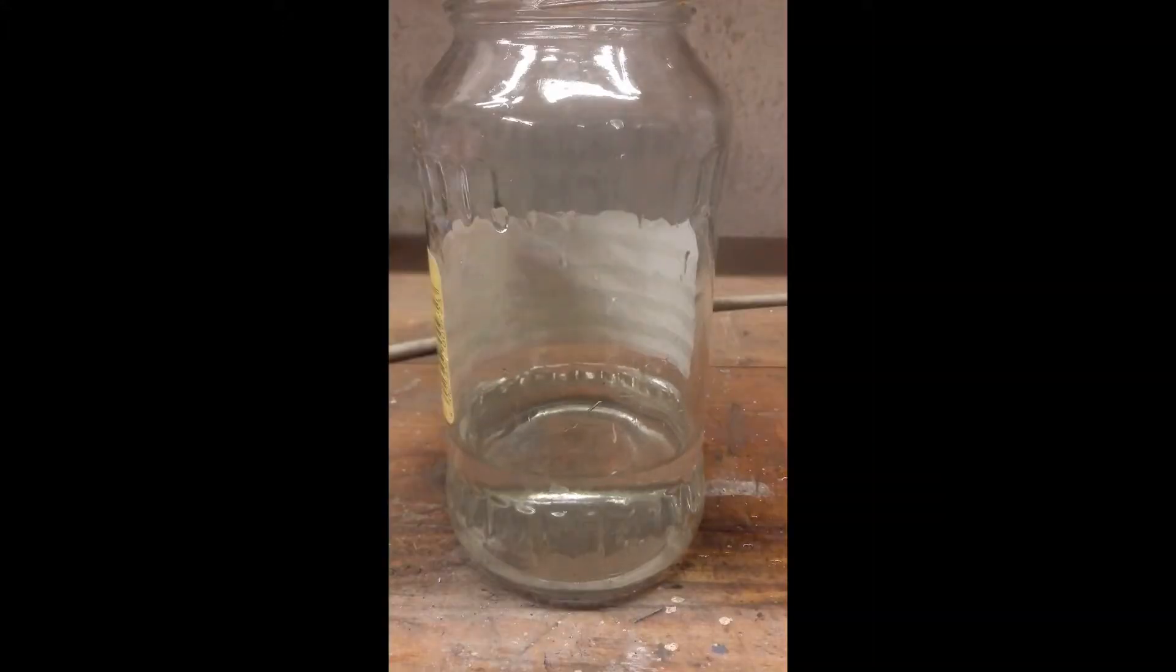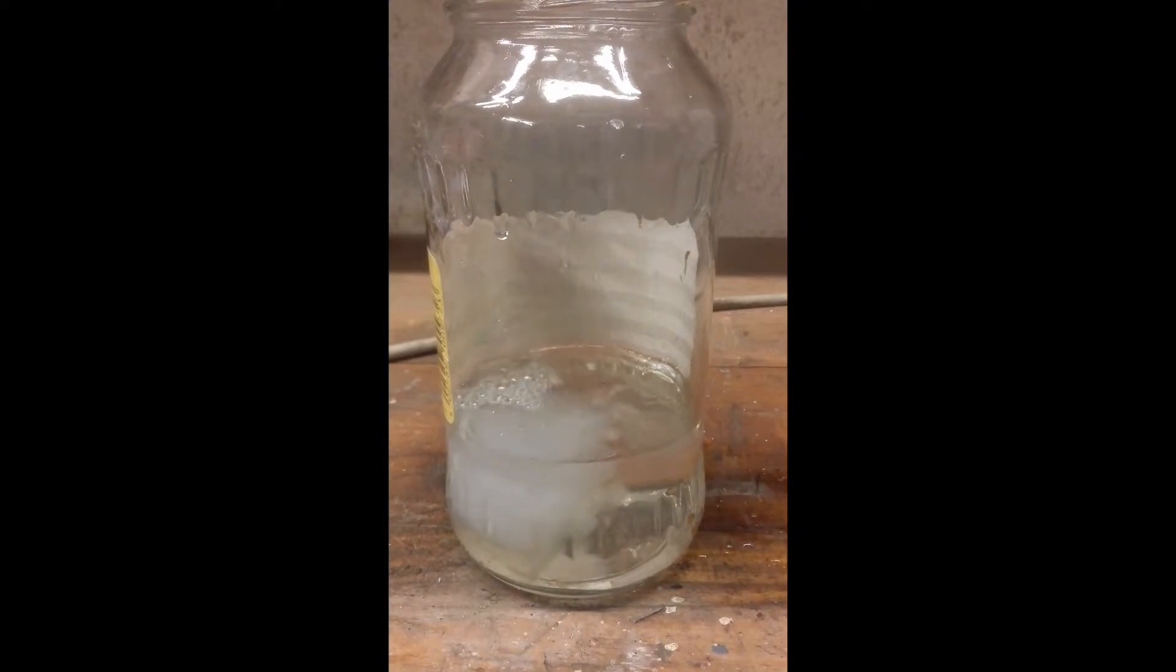Now, add the acid into the jar. A precipitate will form, it is silicon dioxide or silicic acid. We will convert it later to silicon dioxide if it's silicic acid.